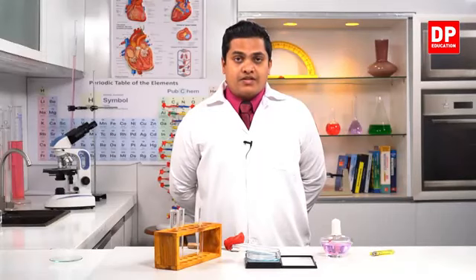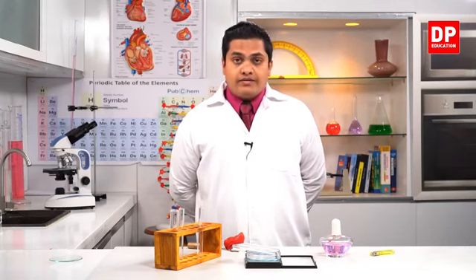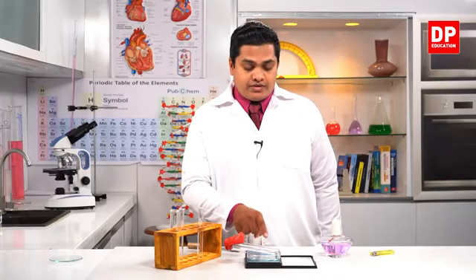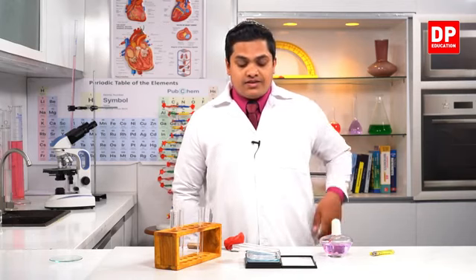We'll keep it somewhat steady to get a clear value. So here you can observe the digital balance is printed. The value is being printed as 32.57. So my value is 32.57, right? Remember the number, children, 32.57. That's the mass of this system.